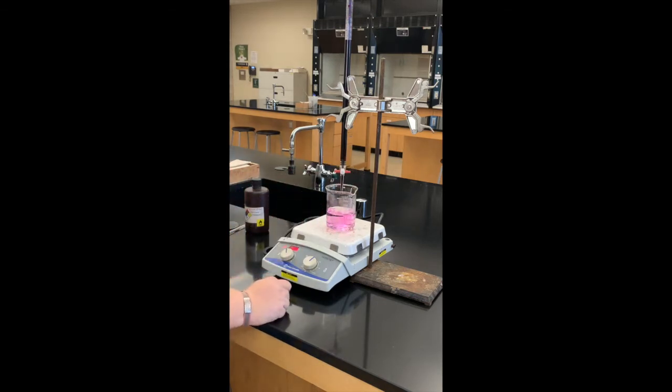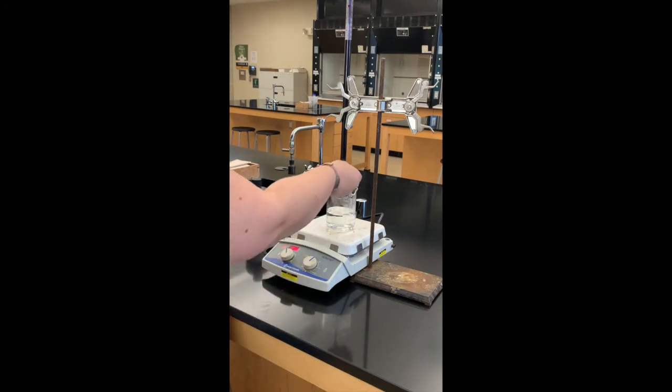Remember that pink is going to go away for those first few drops — it's probably because the potassium permanganate is not at the same temperature as our solution. Now that it's clear we can go ahead and finish titrating.